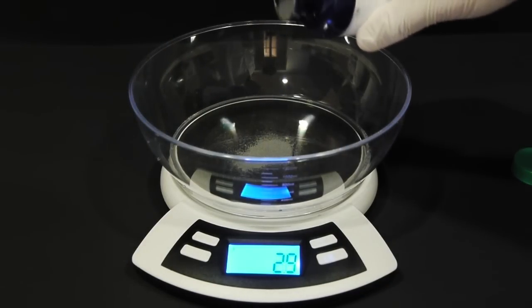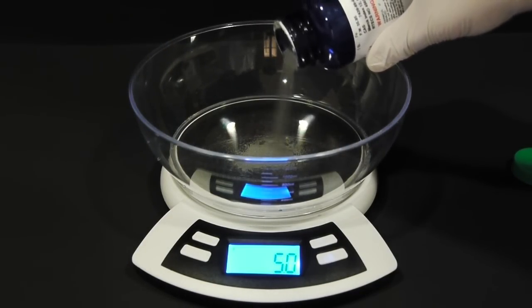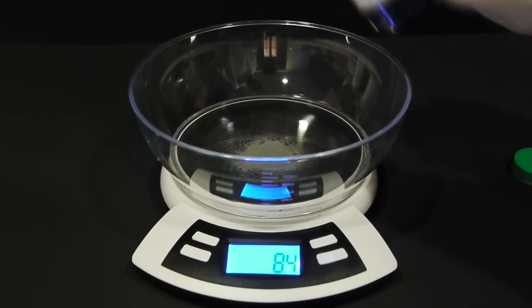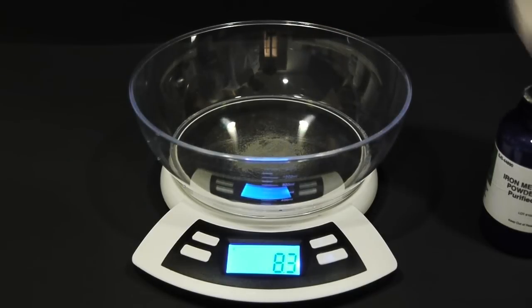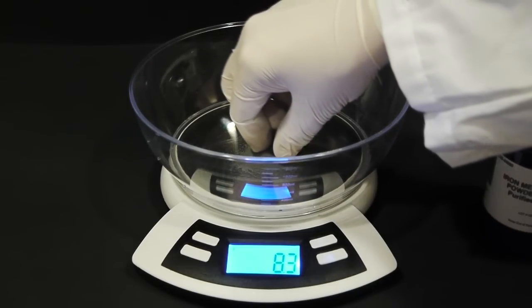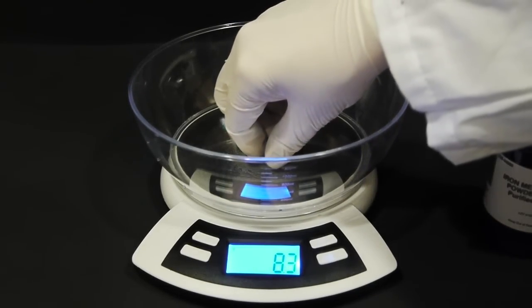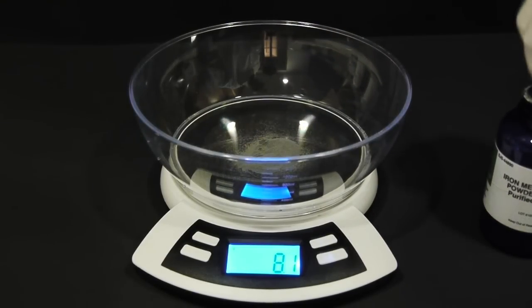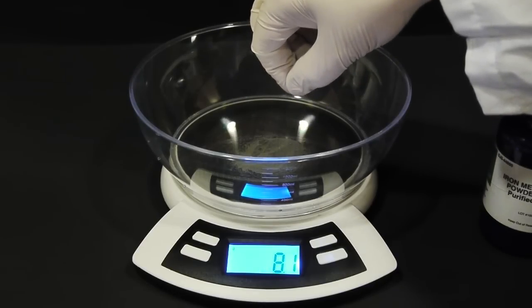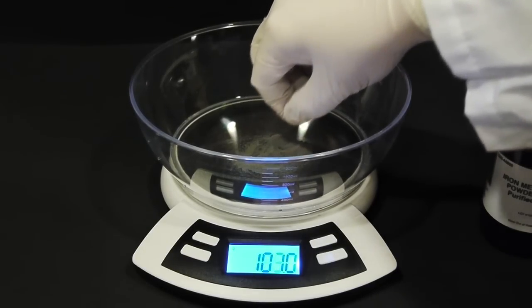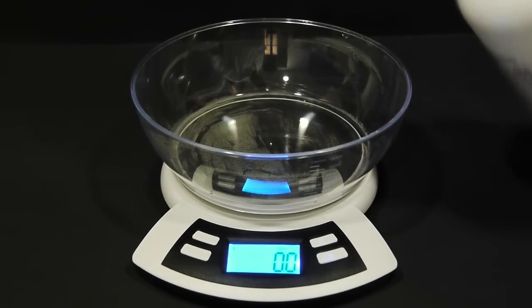Now to kick this off, I'm going to add 8 grams of iron powder. Now there are better ways to measure these substances. However, I'm going with the quick and easy method. This is where I pull it straight out of the bottle and then remove the remnants with my fingers. Of course, I'm wearing gloves. We're close. Almost there. Boom. 8 grams. Excellent.